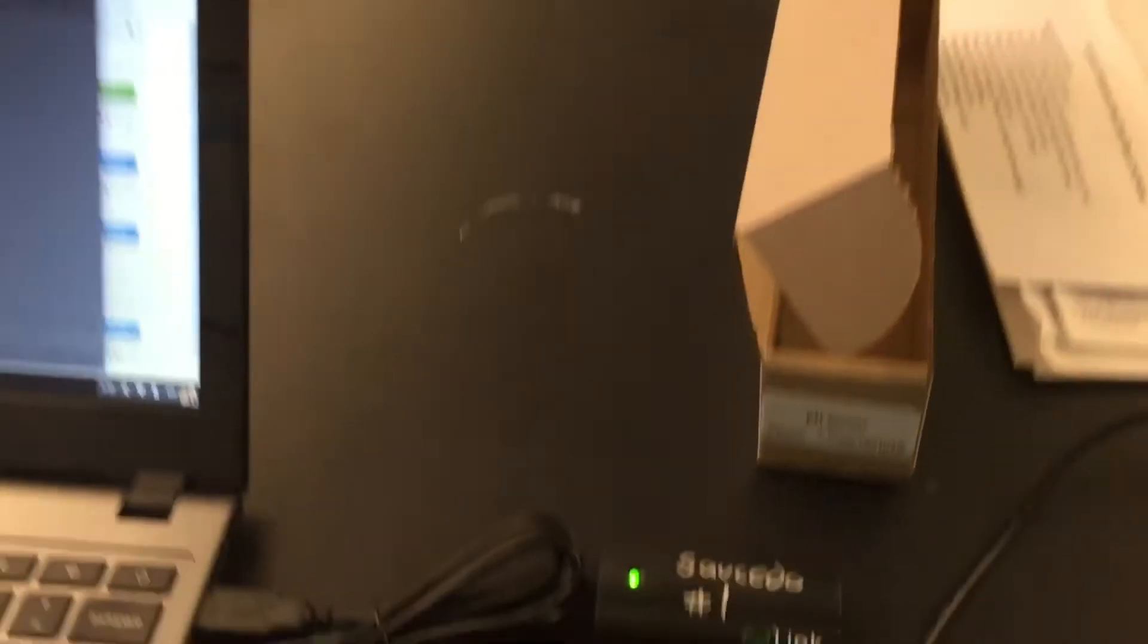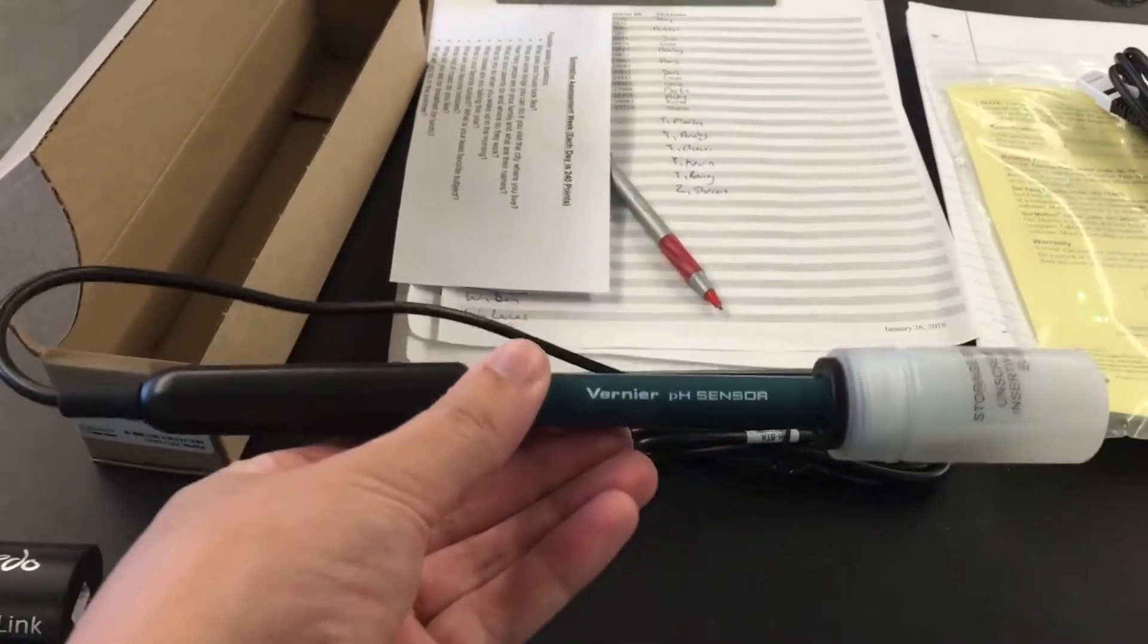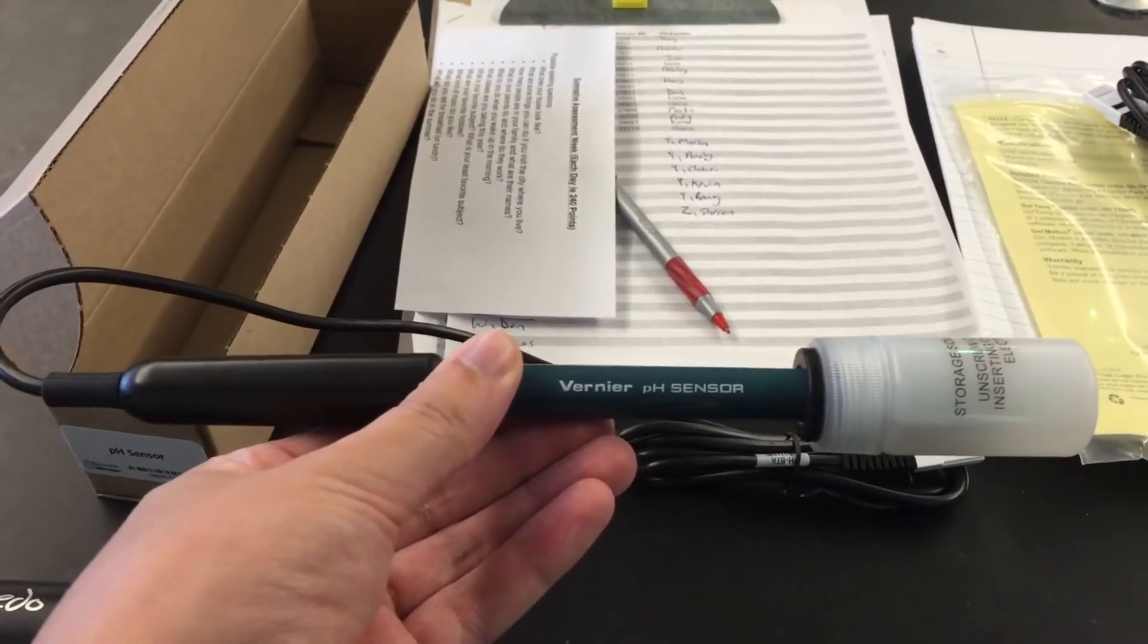In order to use a pH probe you need a Golink cable connected to your Chromebook and then this item itself is the actual pH probe.